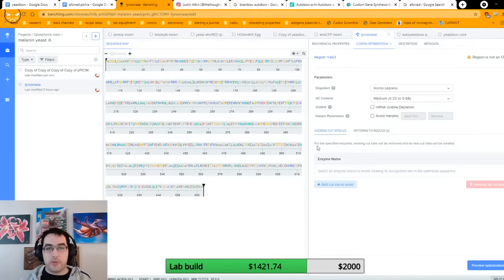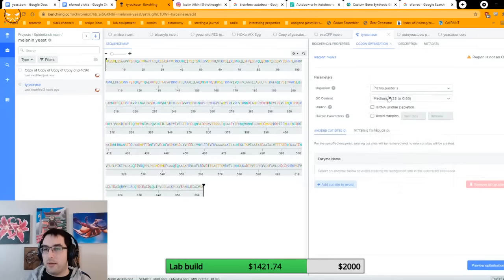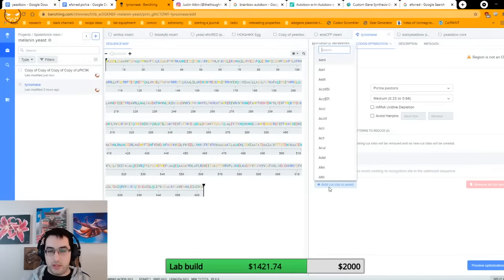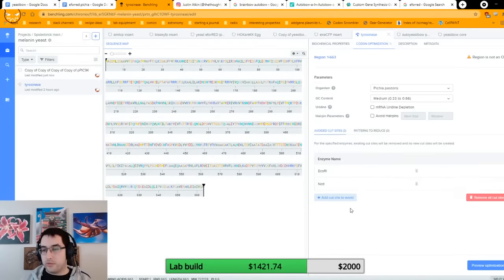So basically what this is going to do is take this amino acid sequence and translate it back into DNA in the species that I tell it. So I just scroll down, I pick Pichia, I can ignore all of this. I want to avoid EcoRI. Come on, there you are. And I want to avoid the other one, because those are the ones I'm going to use.